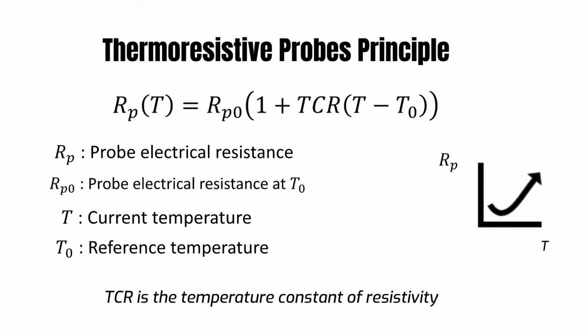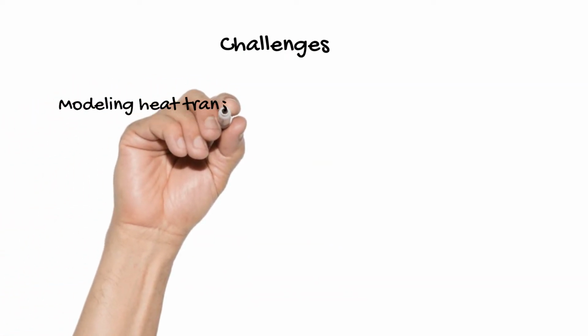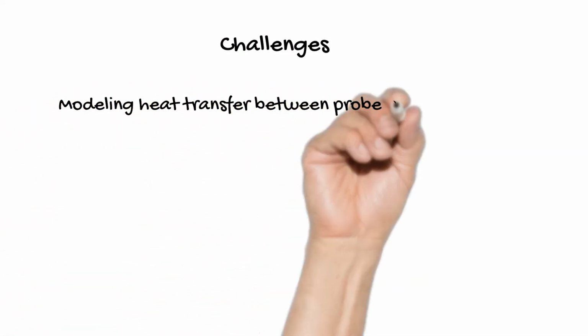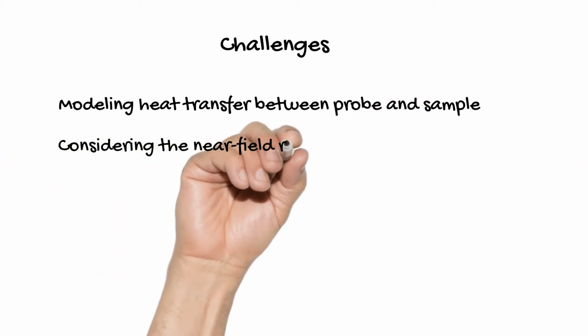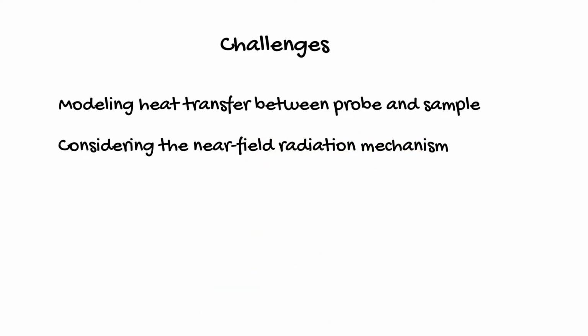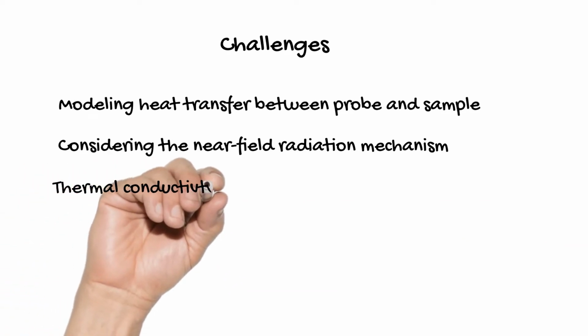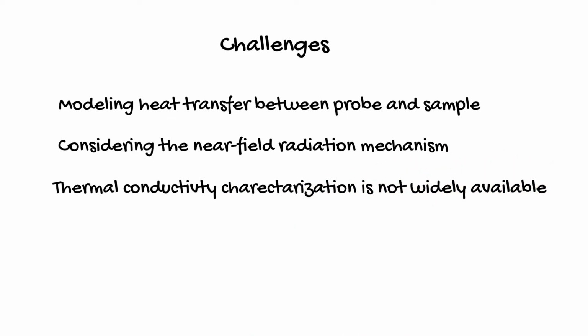Some of the challenges in this technique are in the modeling of the heat transfer between the probe and the sample, especially in the contact region. Also in considering the near-field radiation mechanism, and this is very important for vacuum environments. Another challenge is that the characterization of the thermal conductivity is not widely available, and this is because of the temperature difference between the sample and the probe, which is because of the lack of sufficient calibration techniques. There are some calibration strategies that have been developed by researchers to address this challenge.